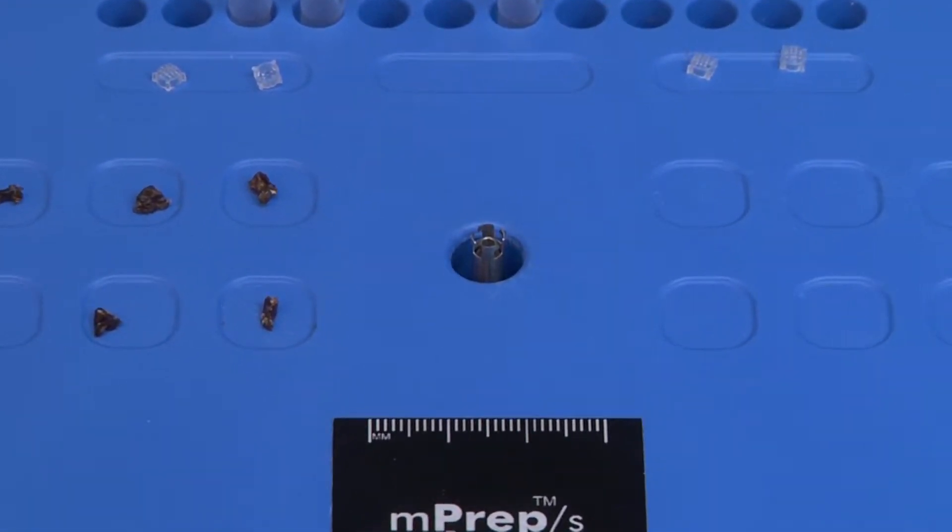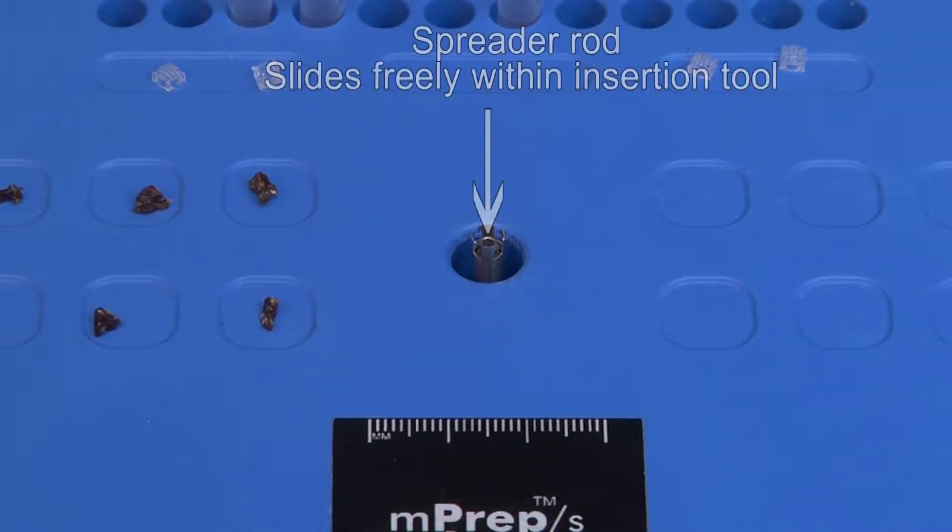The MPREP screen insertion tool is located in the center of the workstation. Within the insertion tool is the spreader rod. This rod moves up to spread apart the screen, to open a slit that is used to pinch mount specimens.